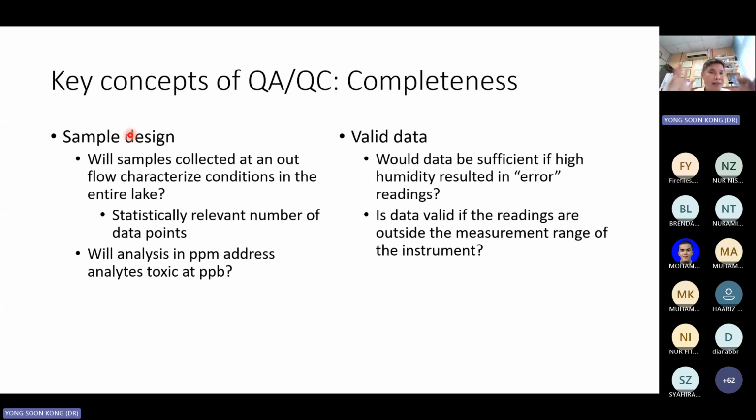We sample a lot, but that doesn't mean we analyze all of them. We only analyze if the initial analysis comes back not so good, then we will run the rest. So that is the trick. But in order to address this one, we always take twice the minimum samples that we want.